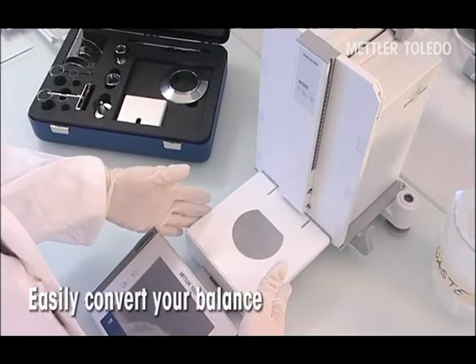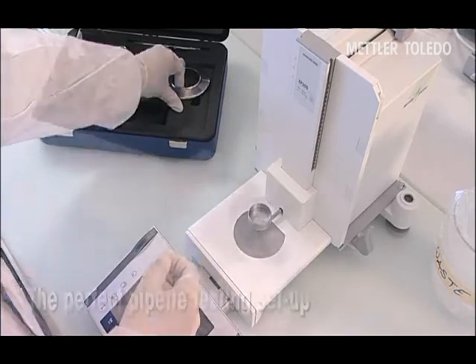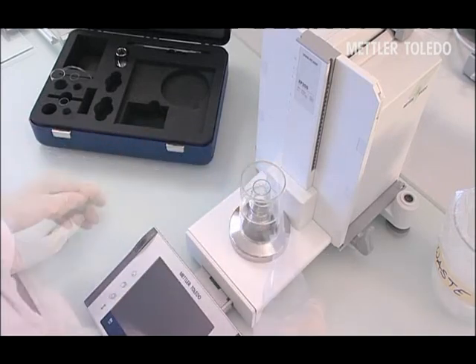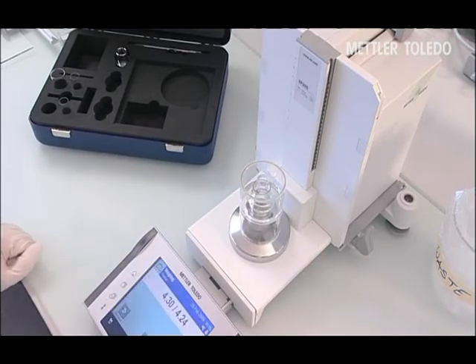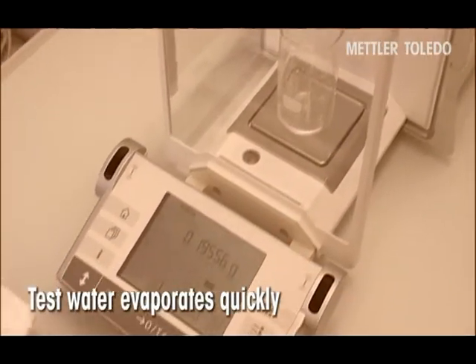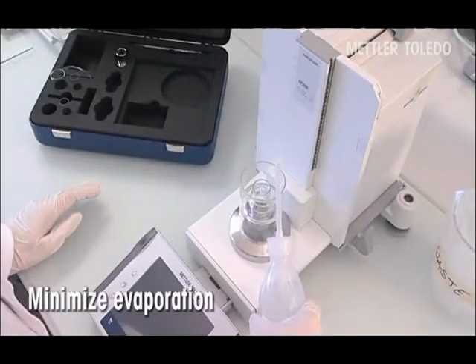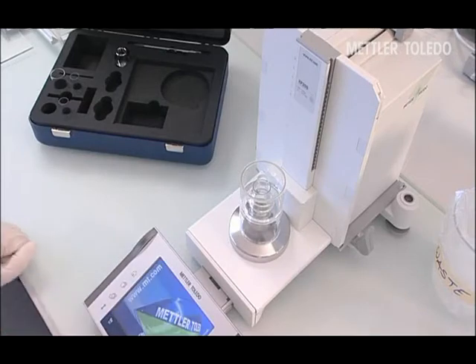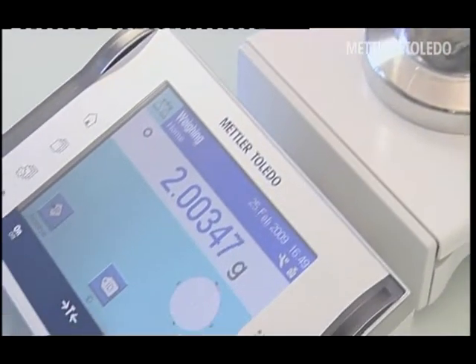Mettler Toledo's Evaporation Traps are designed to easily convert your balance into the perfect pipette testing setup. When test water is dispensed into a simple beaker, evaporation of the water generates error. Mettler Toledo's Evaporation Traps work to minimize evaporation of the test water. The optimized design offers ergonomic handling and unmatched performance in terms of evaporation and repeatability.